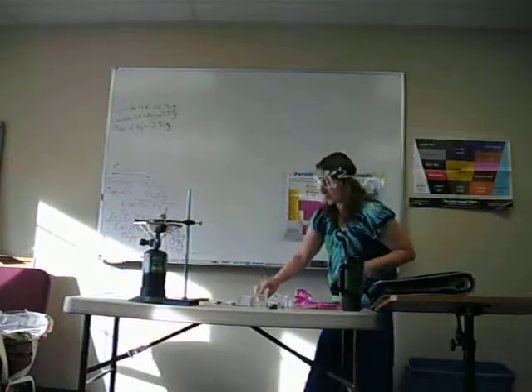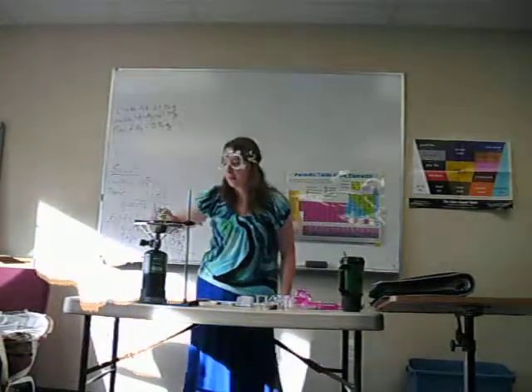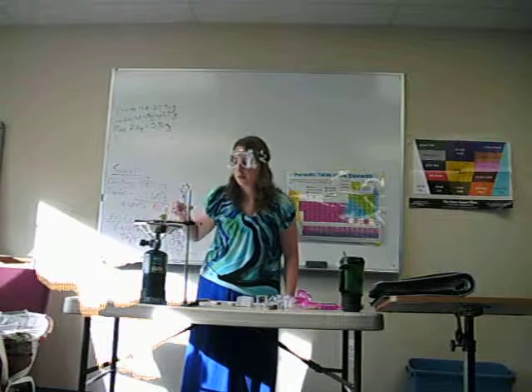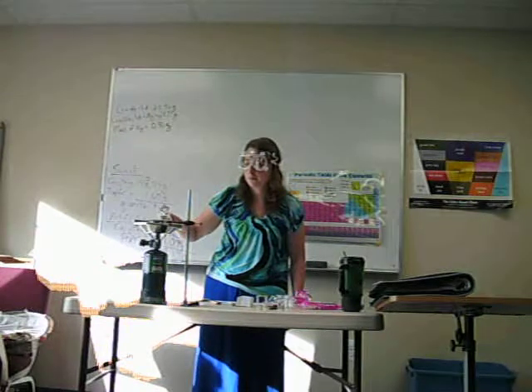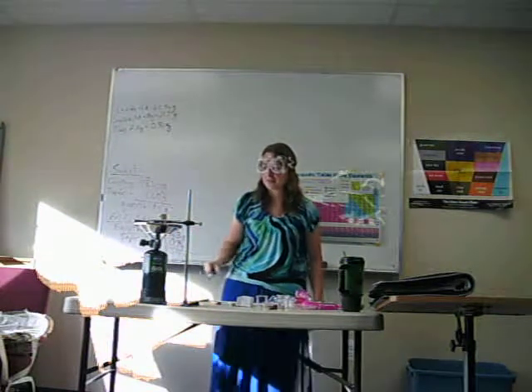While this is still heating, is the crucible red yet? It doesn't look red on mine. There we go. Now we're moving. Looks like we're losing a little mass to vapors there.